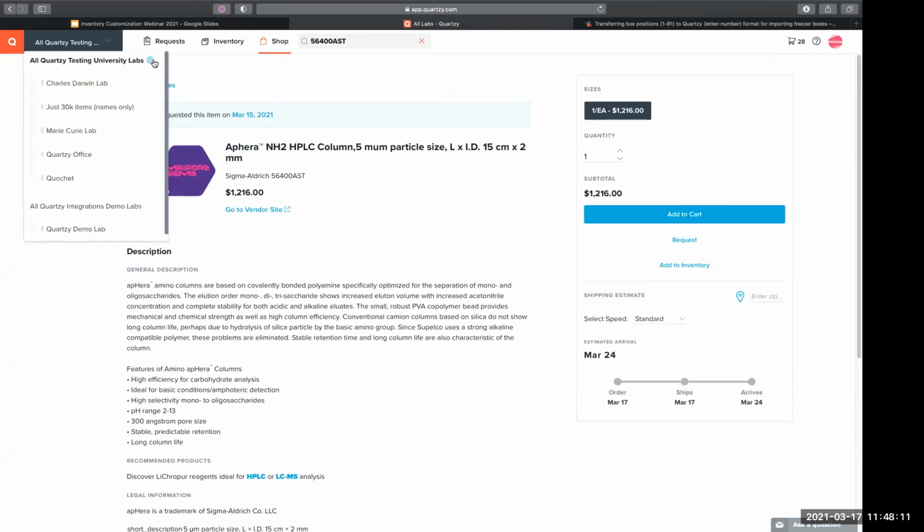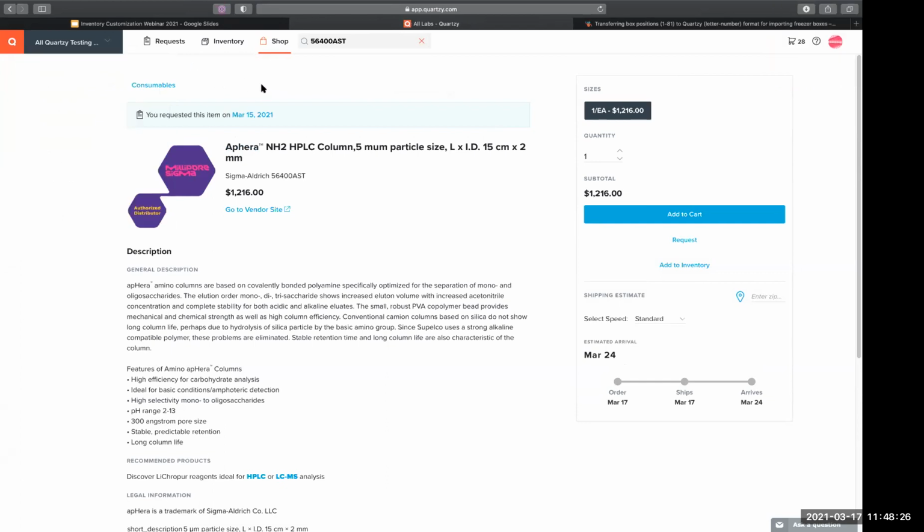So what was that next one? The equivalent matches. Yeah. So if you're interested in learning about some of our equivalent matches, how they're made, what it means to get an equivalent match, definitely join us for that webinar. And then what was that next question after this one?